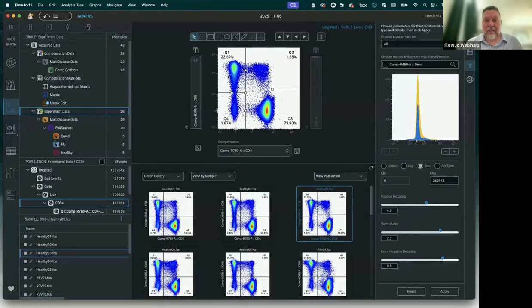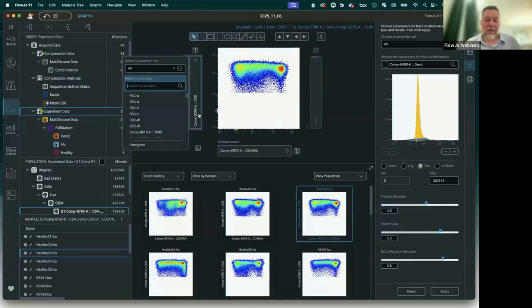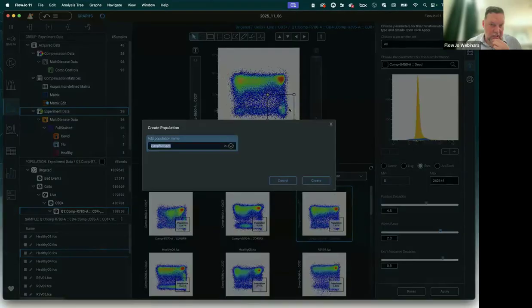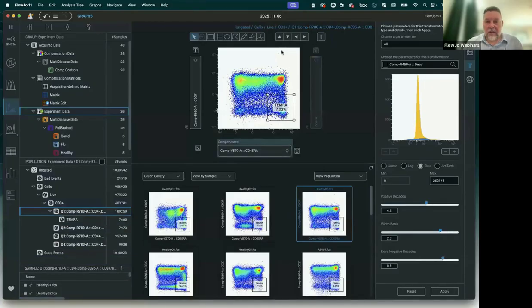And then if I go into my CD8s here and we look at some functional information about these cells, we're going to go CD45 RA on the X and maybe CD27 on the Y, which should give me some nice T-EMRAs to gate on, T effector memory RA positive cells that have been differentiating, right? So I'm just going to call this TEMRA.